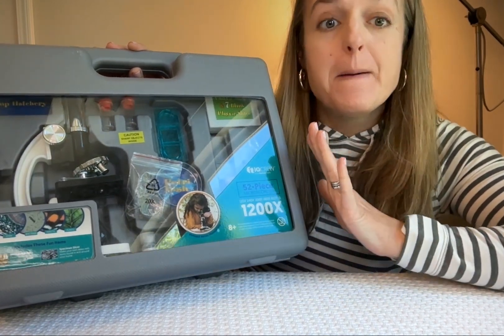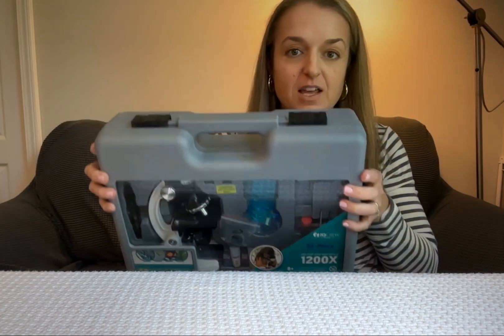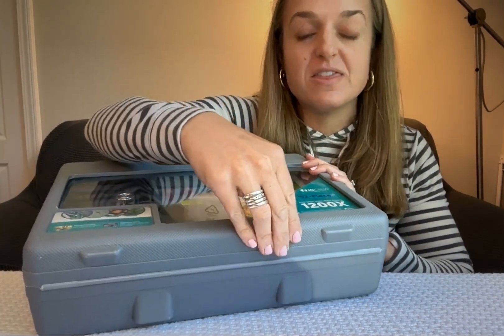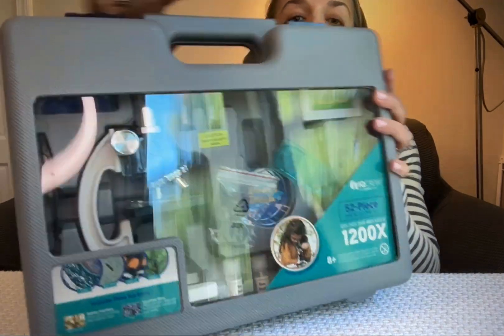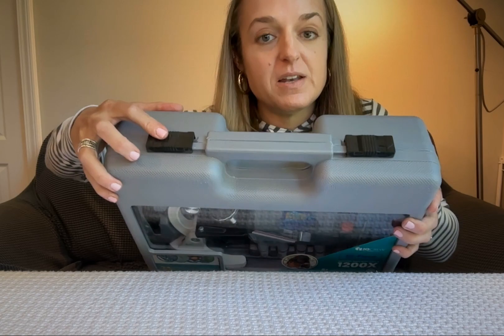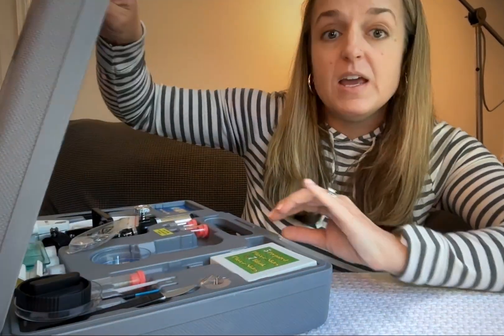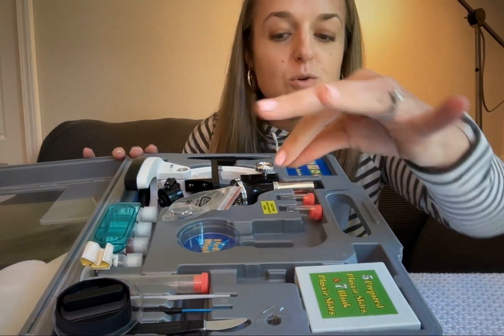This is the IQ Crew microscope set and I'm going to show you what's in it. First of all, it comes in this case — it's kind of like a briefcase that is very substantial. This gray part is thick plastic; this part is see-through so it's thinner. There are locks up here that keep it nicely closed.